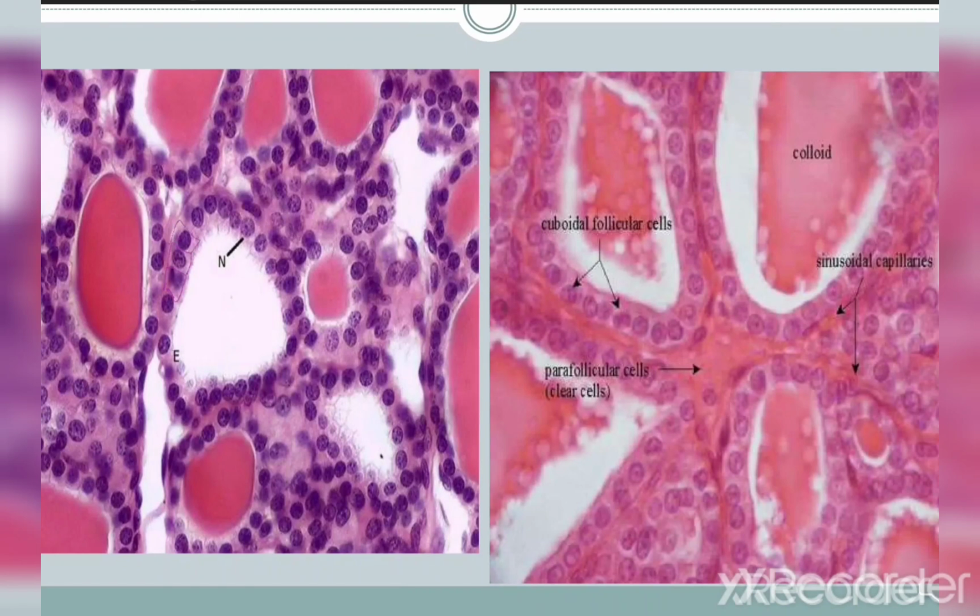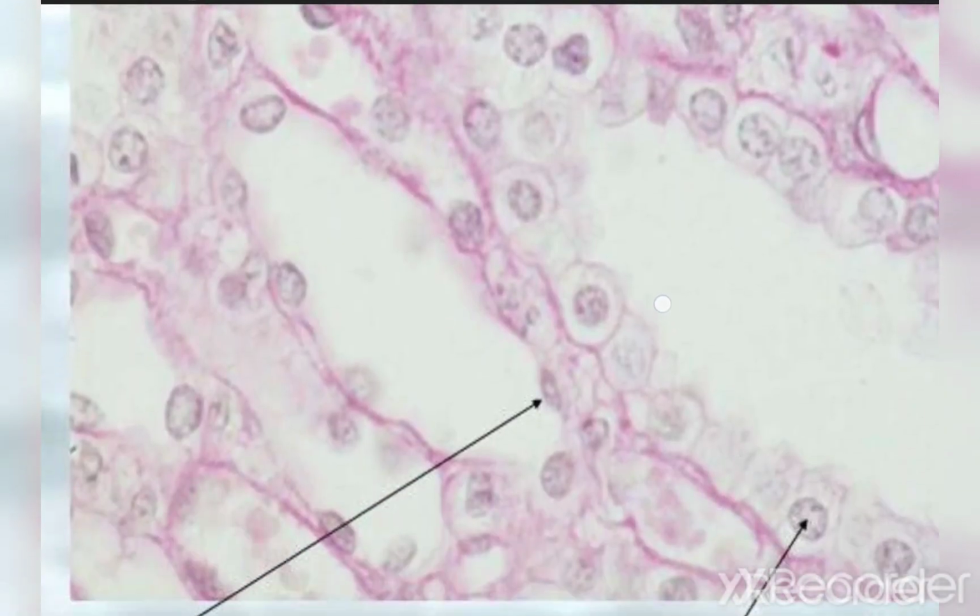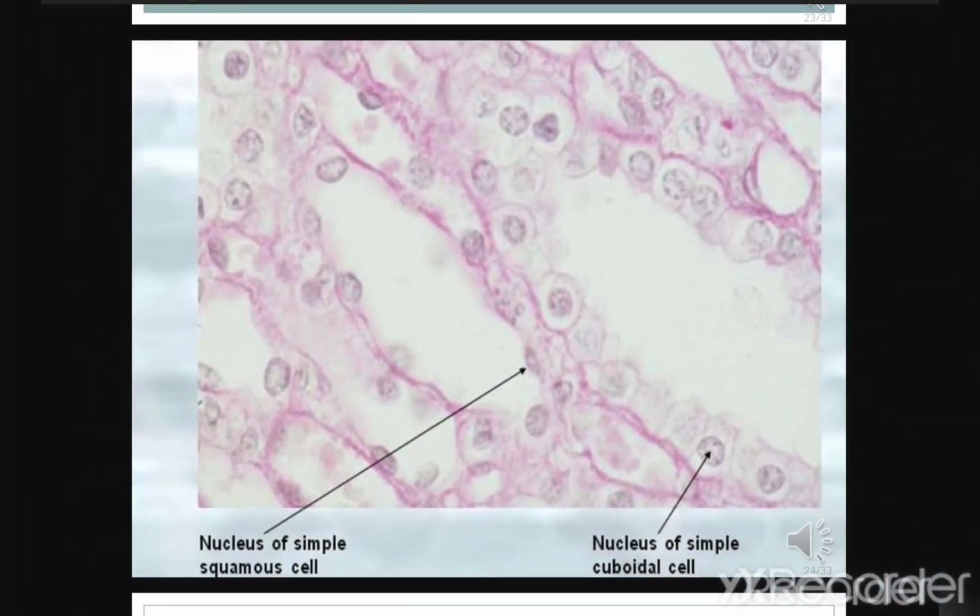This is a cross section through urinary tubules. The urinary system, inshallah, you will study next year. It has a group of tubules in cross section. Some of them are lined by simple cuboidal epithelium. You can see the central spherical nucleus and part of the wall which is cuboidal. While this one here has simple squamous cells with a flattened nucleus. This is the thin part of the loop of Henle. They are shorter and squamous in type. Okay?